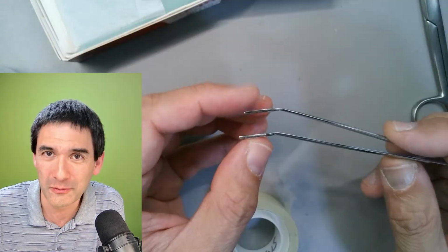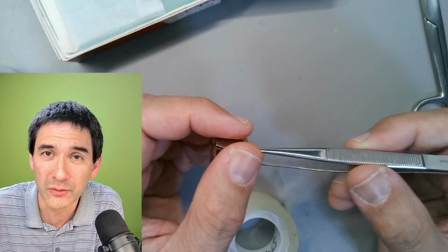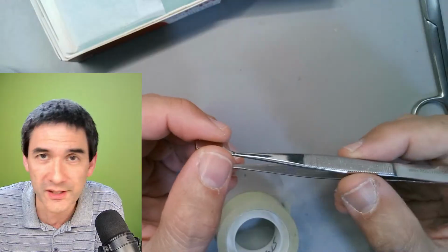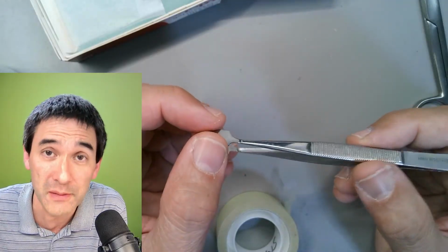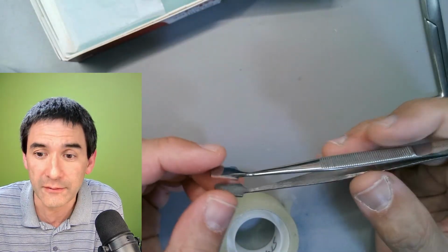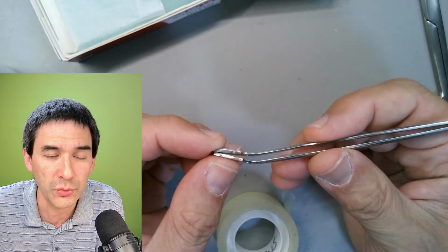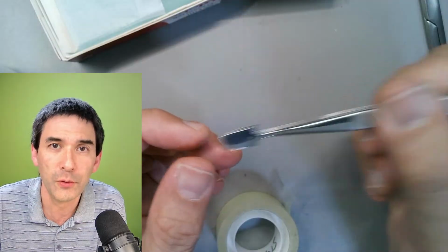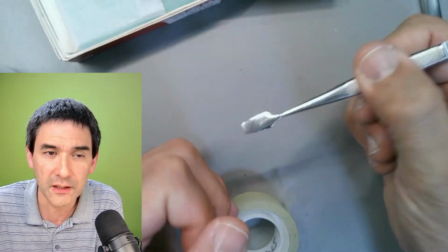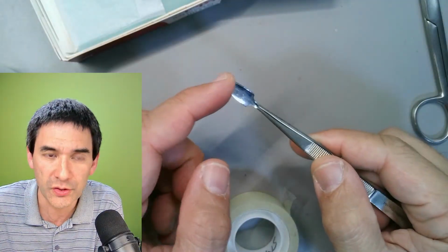Then he basically showed it to some zoologists, entomologists, and whatever, and they said it must be a mite. Because of the 8 legs, so that's kind of how they identified. Yeah, so those tweezers here are used usually for if you're collecting stamps, for example. People use those. You can also use those tweezers for placing a cover slip. However, I will be using those to pull on my eyelashes. That's why they're so flat.